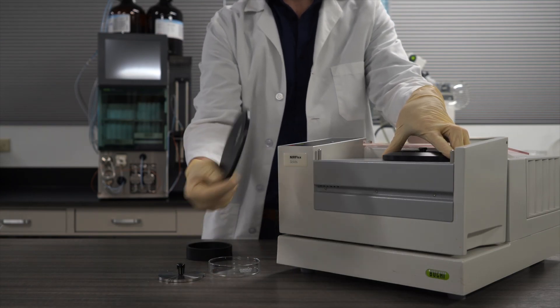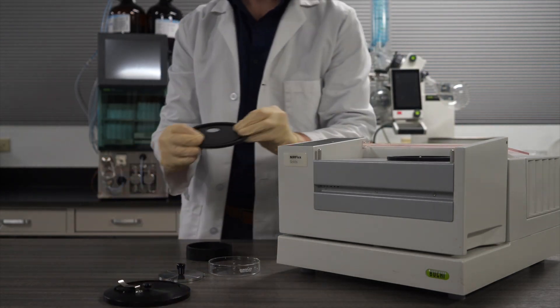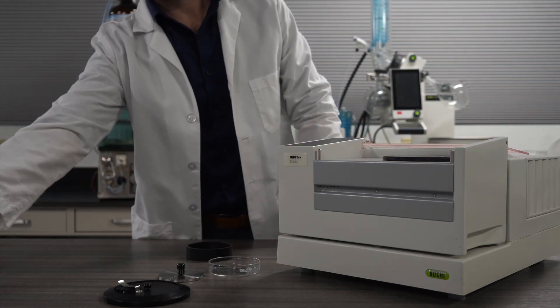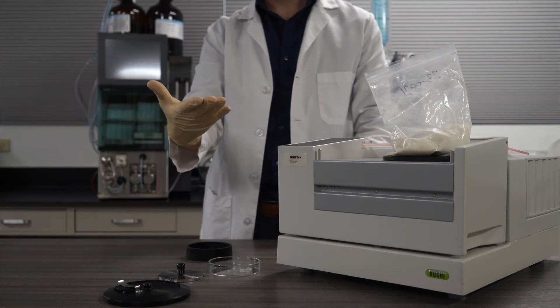This cover is what we call our XL add-on. It fits right on the solids module and enables you to measure your material in a sample cup or even right through a plastic bag.